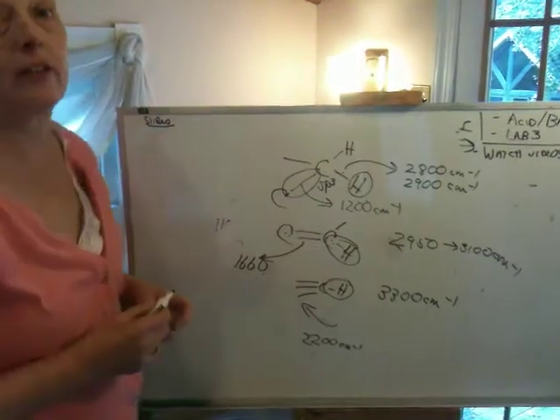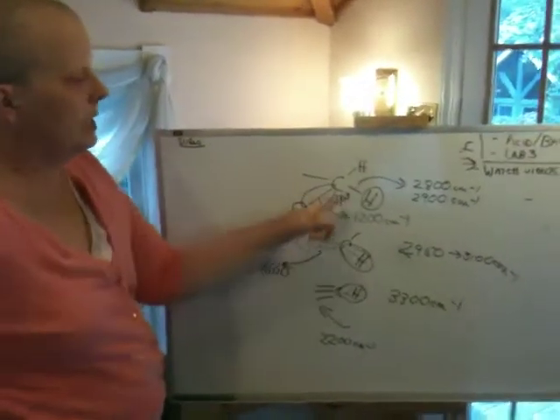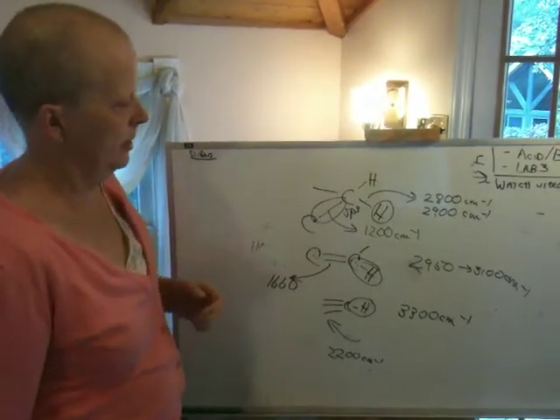This hybridization effect is very, very useful when you're looking at the functional group region, because even though the CH bonds are not functional groups, they do show up in the functional group region. I meant to say functional group region at the beginning of that.